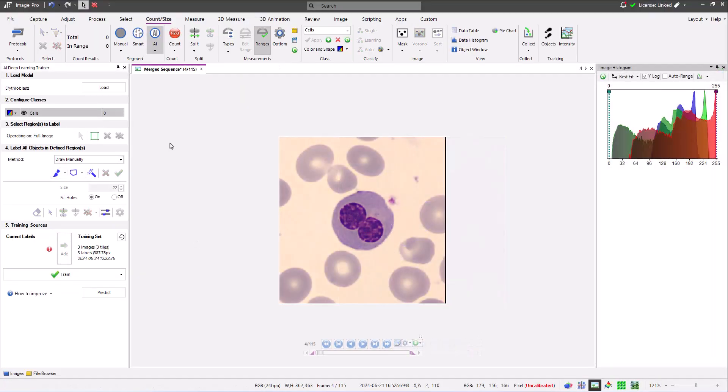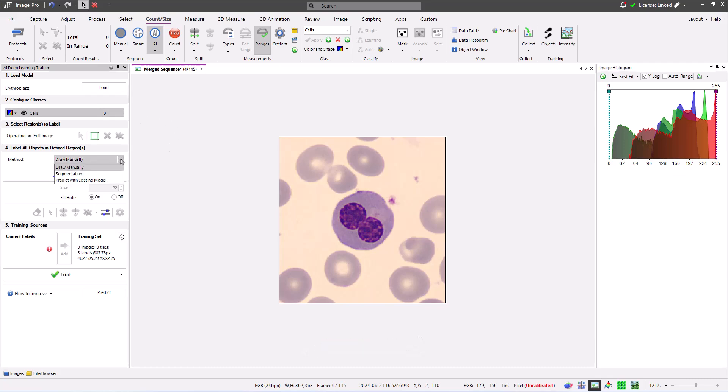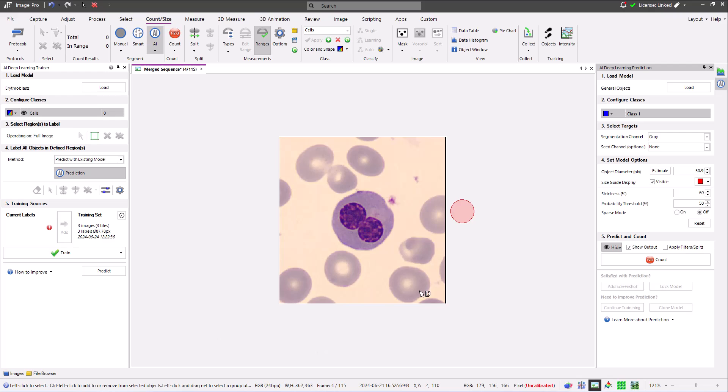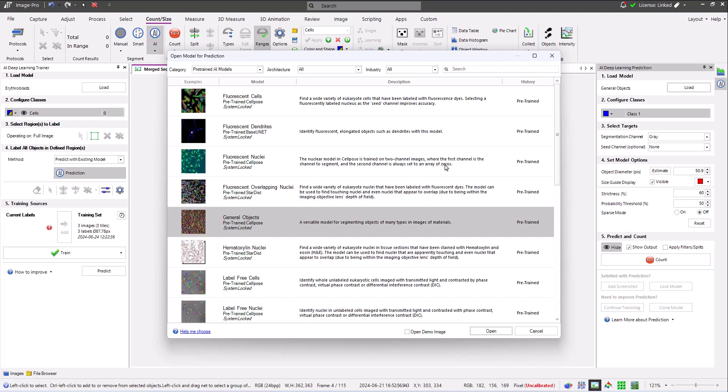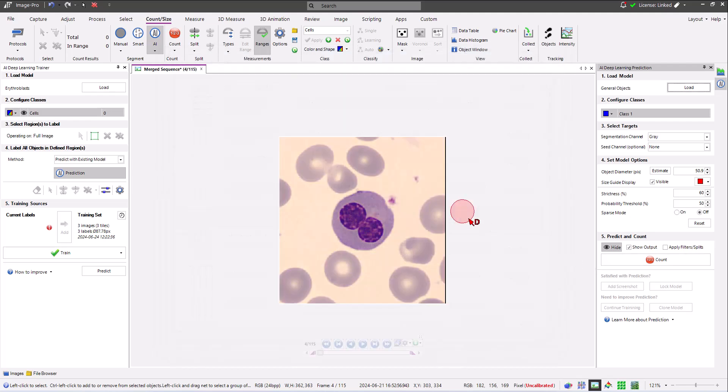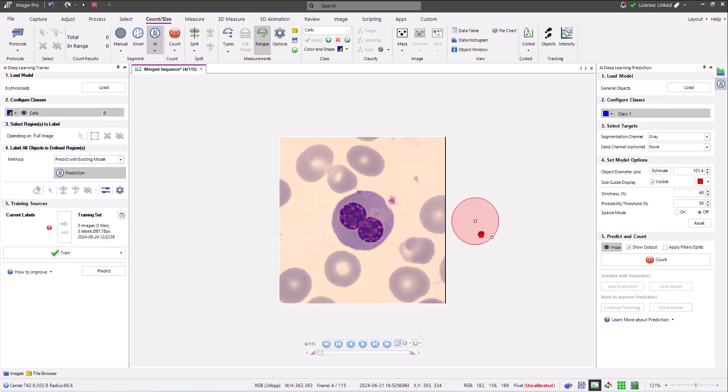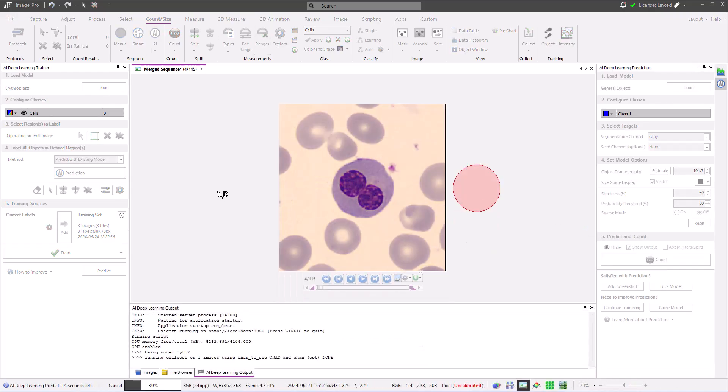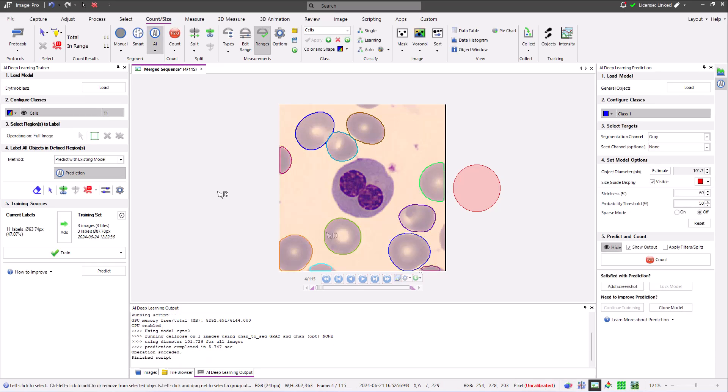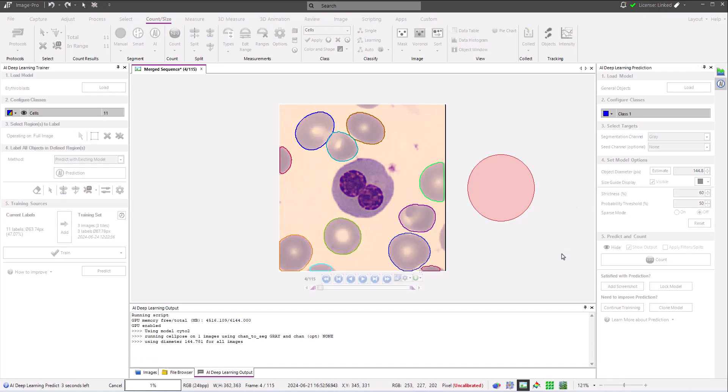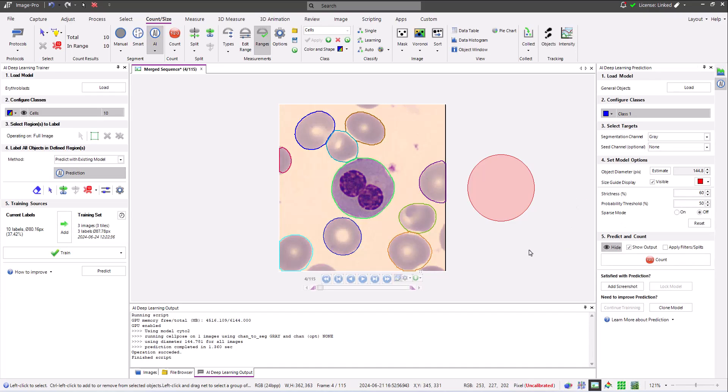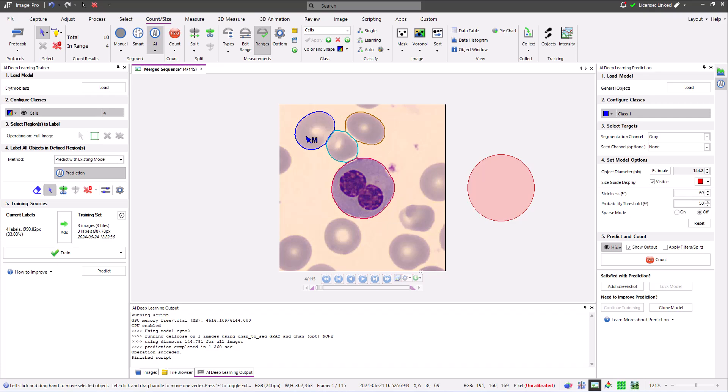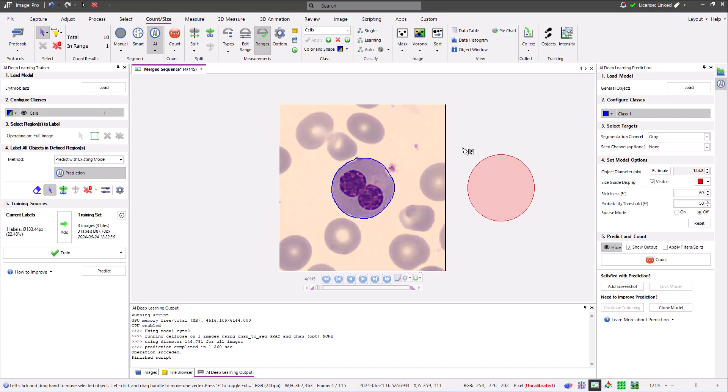Let's now look at other methods of adding training labels, starting with Predict with Existing Model. When selected, I can click on the Prediction button to open the Prediction panel. Here I click the Load button and choose a model. I adjust the Prediction settings and use the model to segment objects in my image. Notice that I have to adjust the diameter in order to segment the central erythrocyte. I can now delete all of the objects that are not erythrocytes and add my training label.